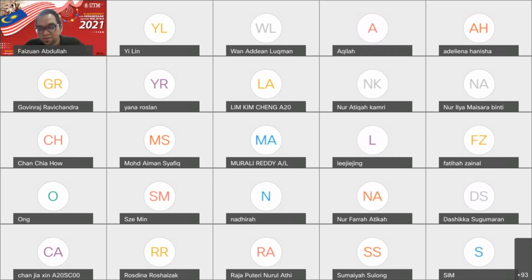Yes, the keyword is homogeneous, right? Thank you to Lim, Al-Zahra, Aiman, Maisara. Aisha said mix thoroughly, yes. We need to mix it to make sure it is homogeneous, like Shafiq, Azwan, Lam Bun Hui and Chong Wan Ching said. Sekata, adun dengan sebati, macam buat kek kan. We need to make sure it is homogeneous. If you make tea, you prepare a cup of tea, right?